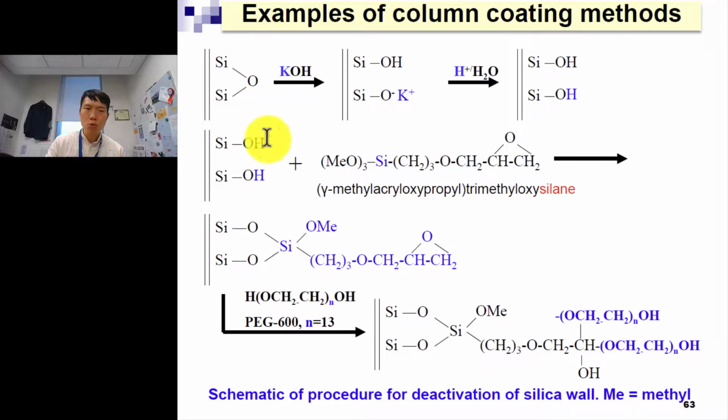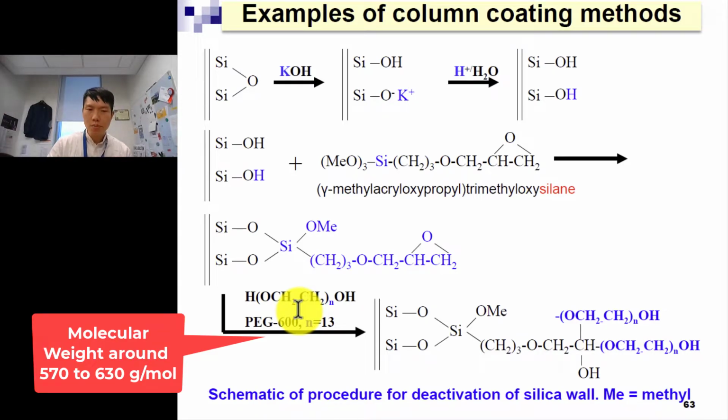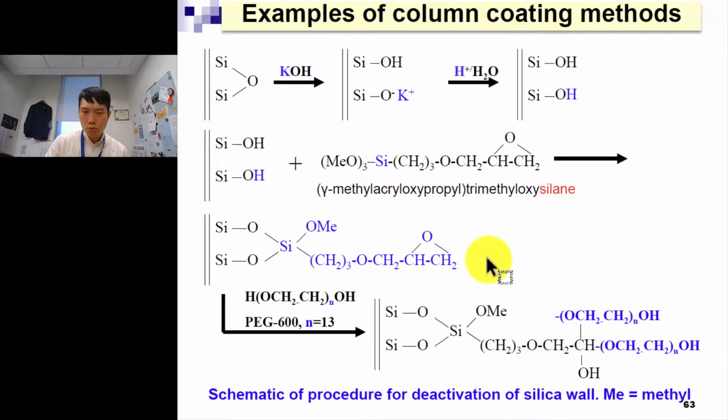Because before that, if you don't do this coating step, then your big proteins will just adsorb here, it just gets stuck and can't move when they're immobilized, right? One is you can't move, the other thing is it blocks the other substrate from going through. Now in this case, this is a polymer with a 600 molecular weight, an intermediate kind of polymer size. N is 13. This is the polymer repeat unit. So then you do a coating inside.